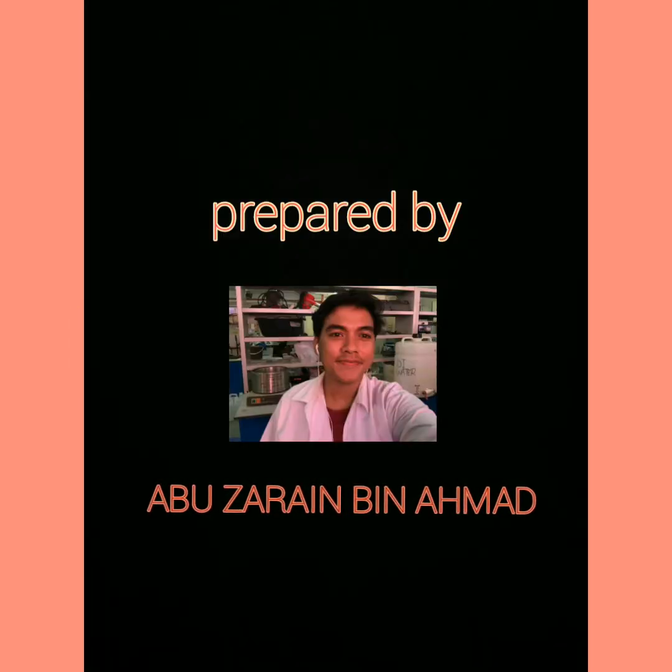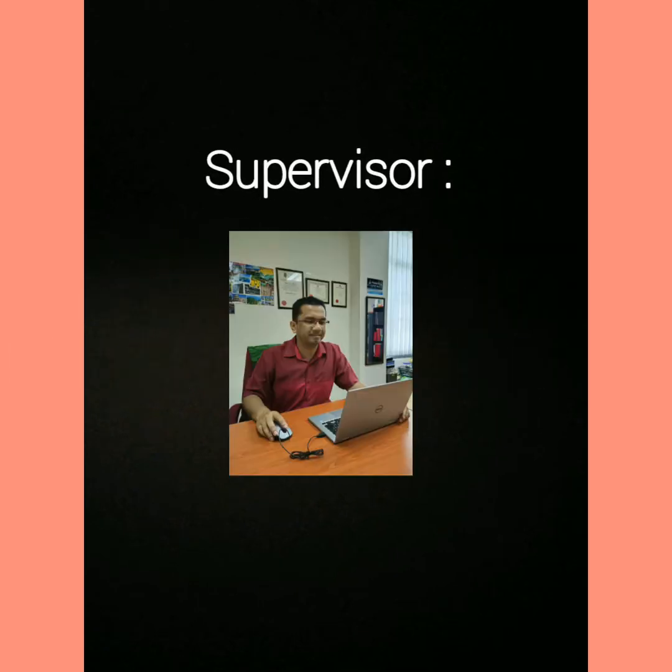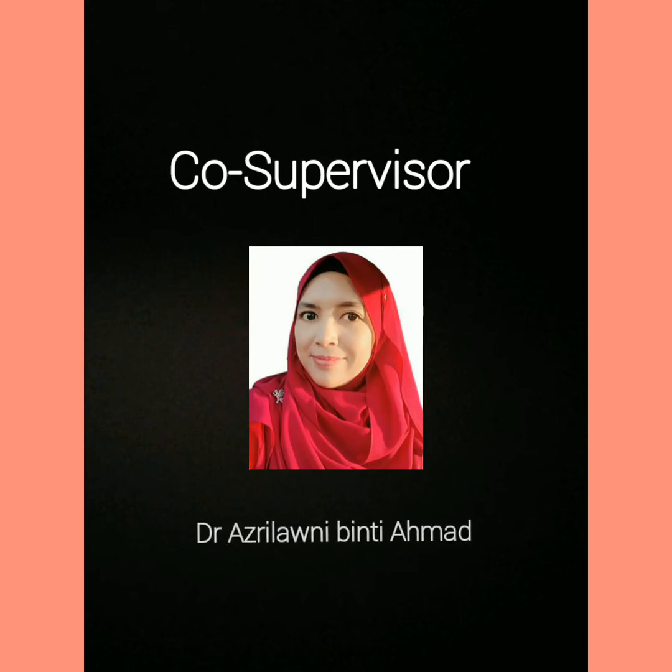So basically today I'm going to explain about my final year project entitled Determination of BPA in river water samples by using MIP SPE followed by HPLC. My supervisor is Dr. Tuan Muhammad Fauzan bin Tuan Omar and my co-supervisor is Dr. Azrilawani binti Ahmad. So let's get started.